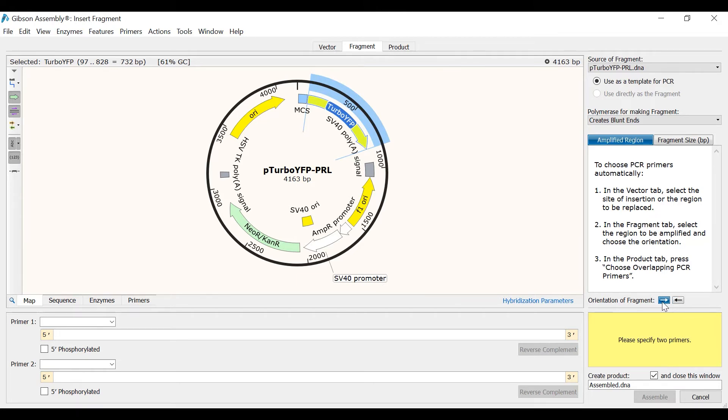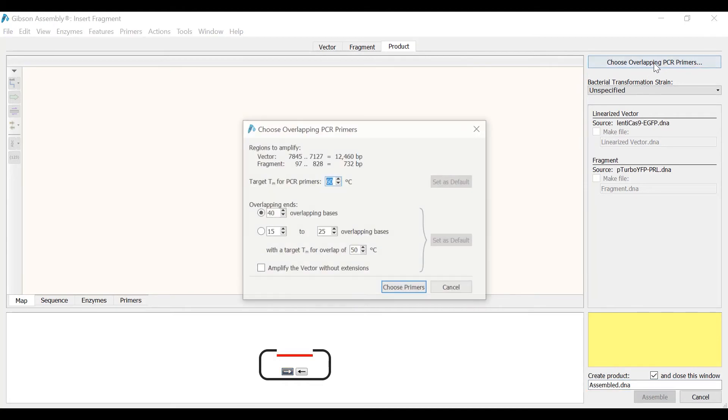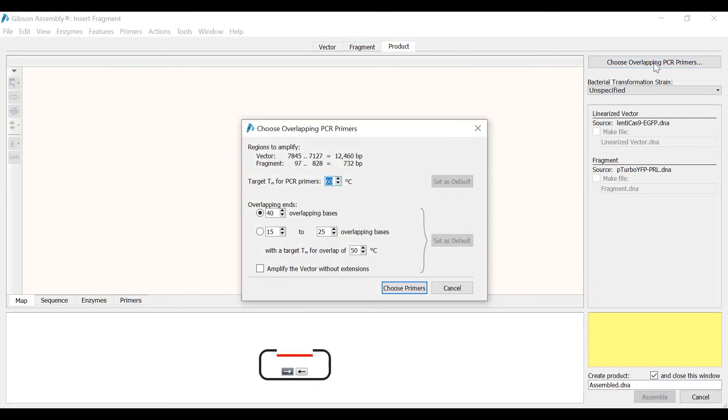I will now switch to the final tab called Product and select the Choose Overlapping PCR Primers button to enable SnapGene to design the most suitable primers for this reaction. In the first option you can specify the melting temperature or TM for the PCR primers. By default this is set to 60 degrees Celsius and I will leave this unchanged.